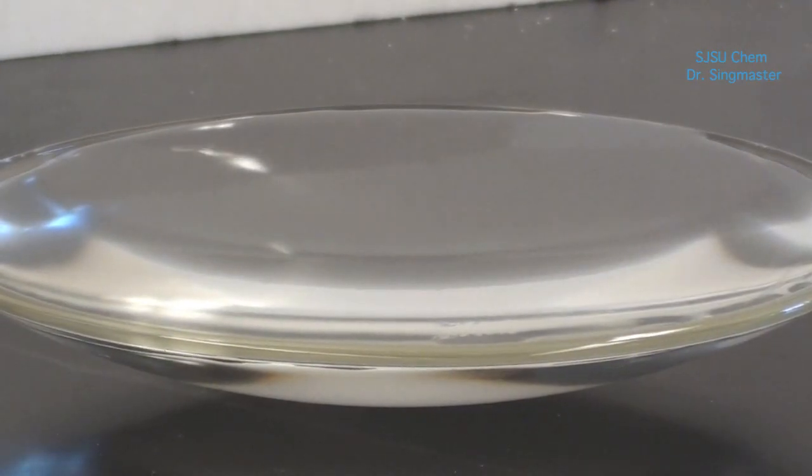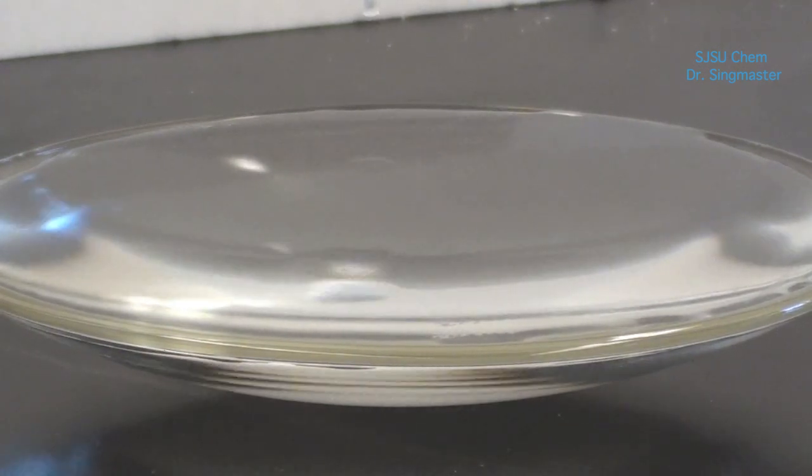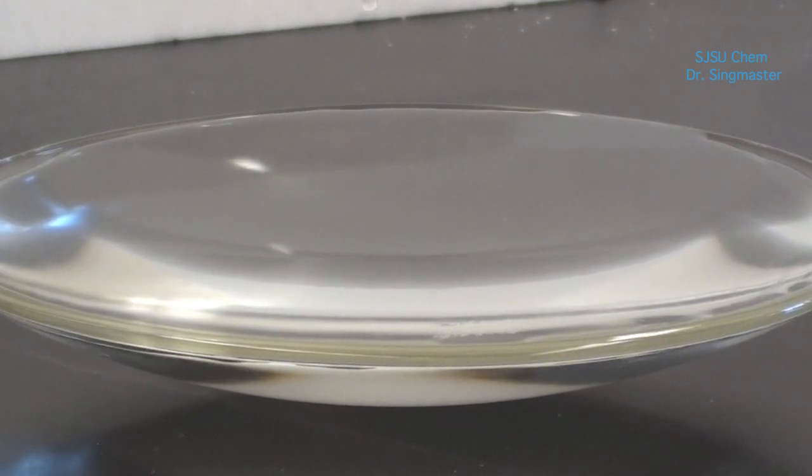Now we're going to start adding drops of the stearic acid solution until you see a small circle looking sort of like a contact lens floating on the stearic acid. You want to count the drops of stearic acid.